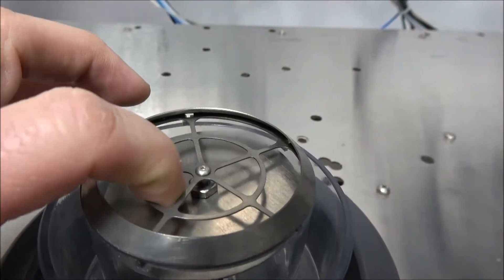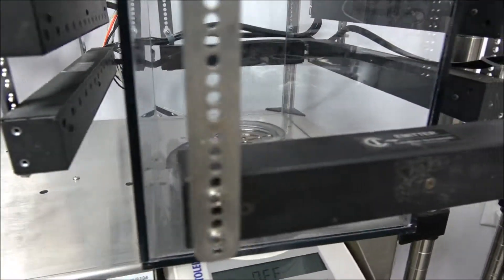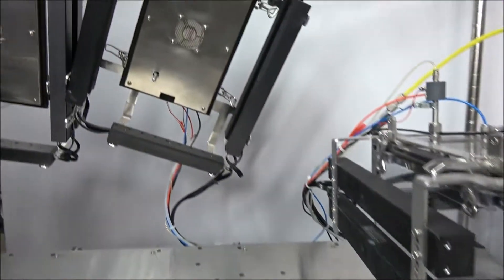New Life Scientific has acquired extra parts, but if you need a specific piece we may have, please contact us. New Life Scientific technicians have connected these systems and paired them with the included laptop.